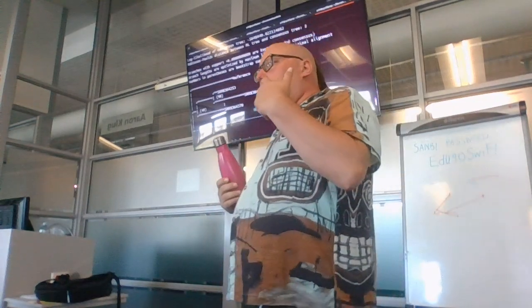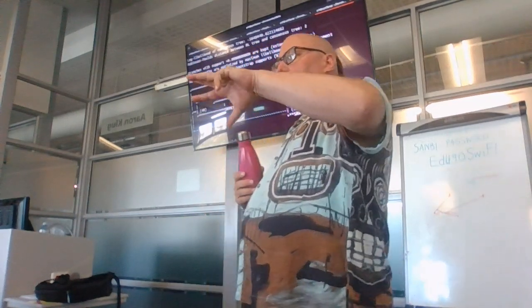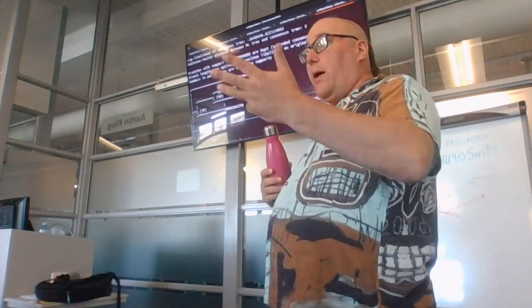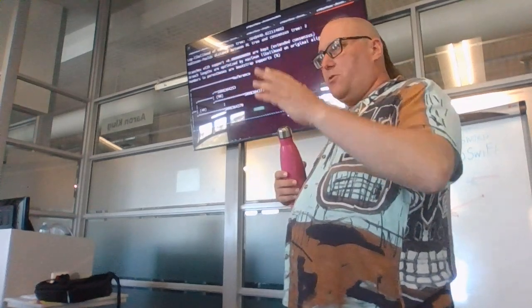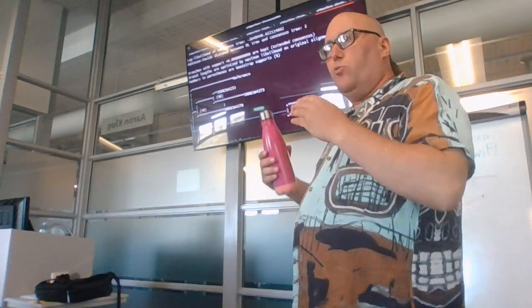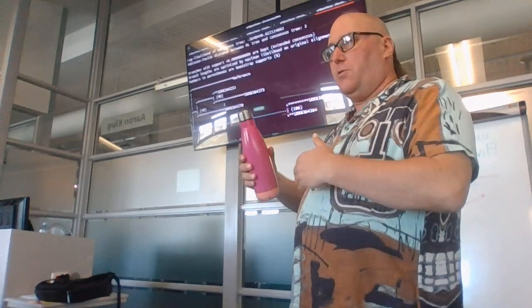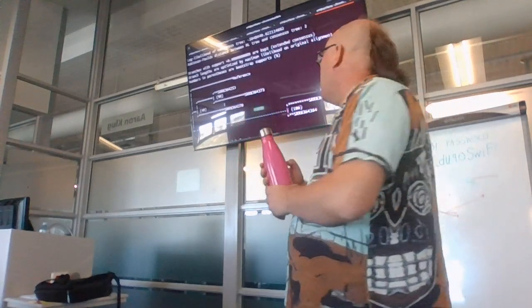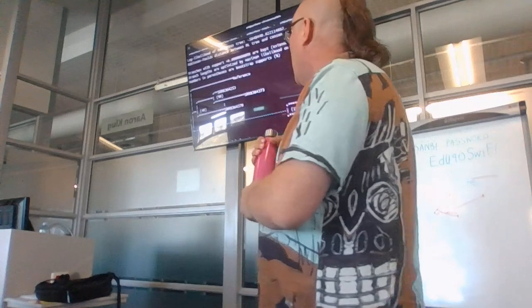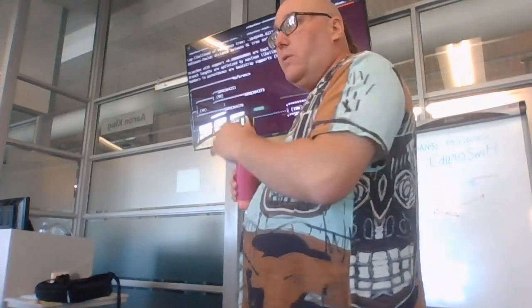Remember that in maximum likelihood, even if you've got a polytomy, in other words, where it looks like the tree should branch three ways, because there's not really much evidence for this one versus that one, the system has to choose a sequence of two-way bifurcations. So we'll see, when we look at the SNP distance matrix, what we can say about the number of SNPs between these samples.